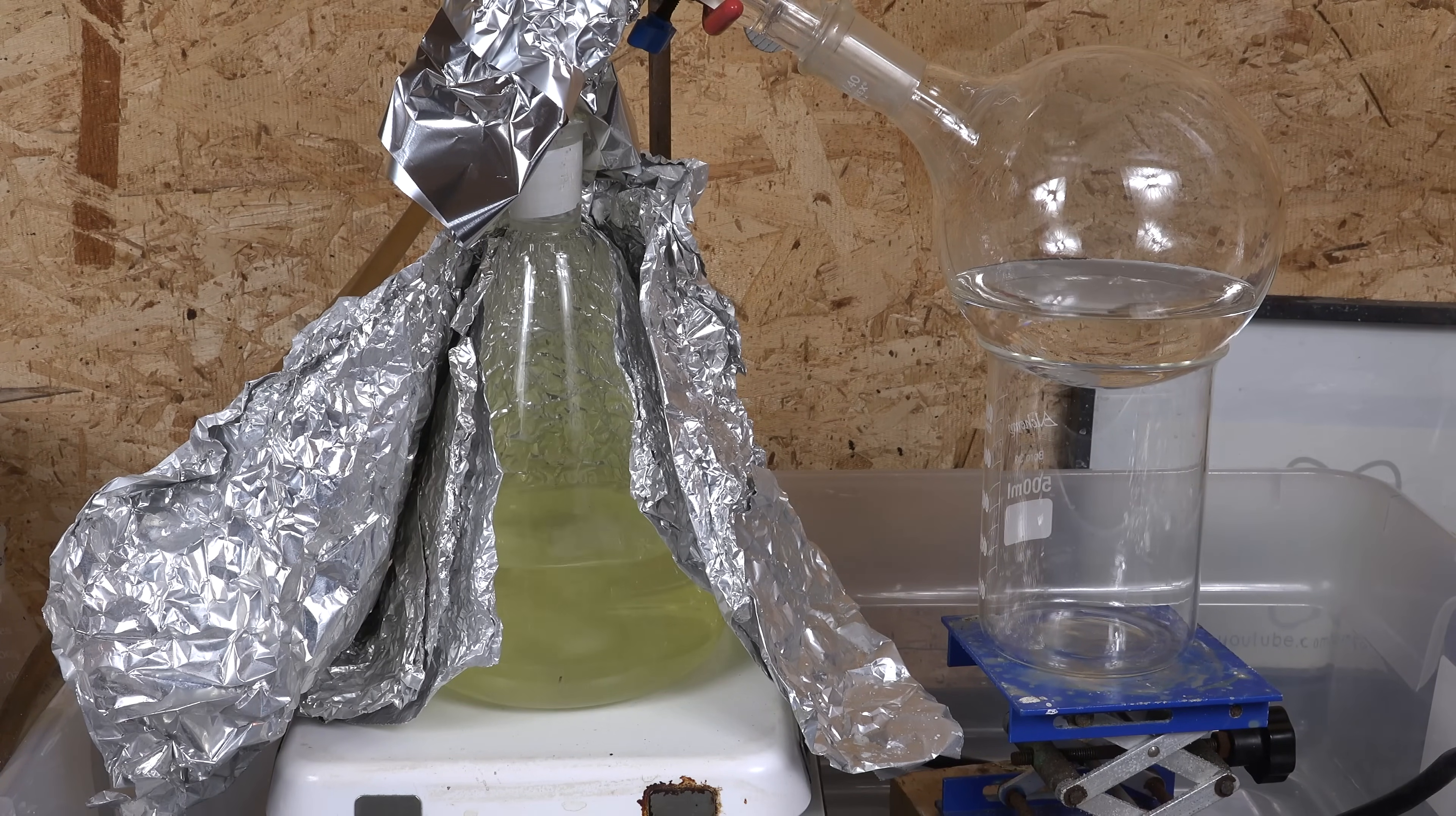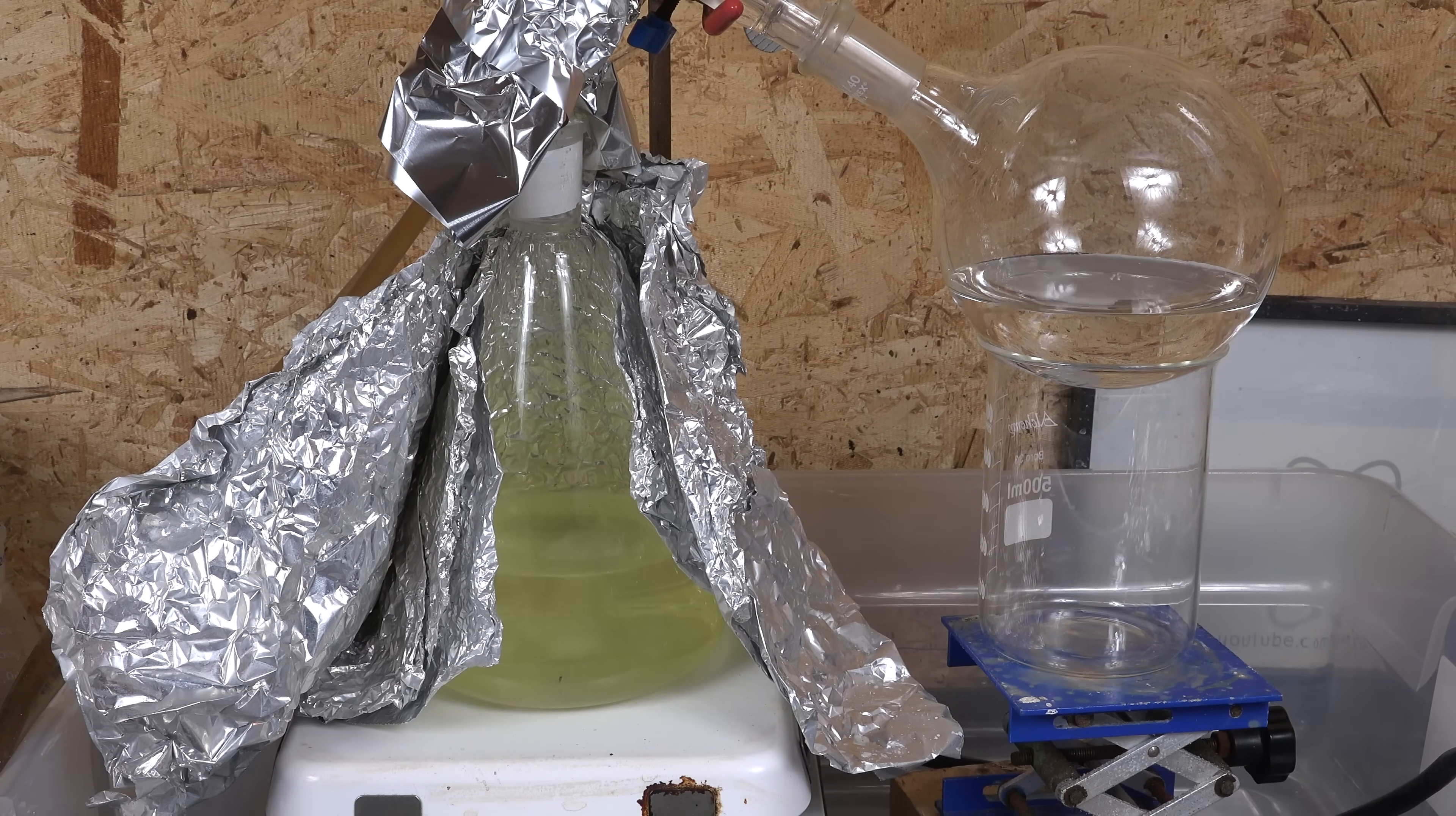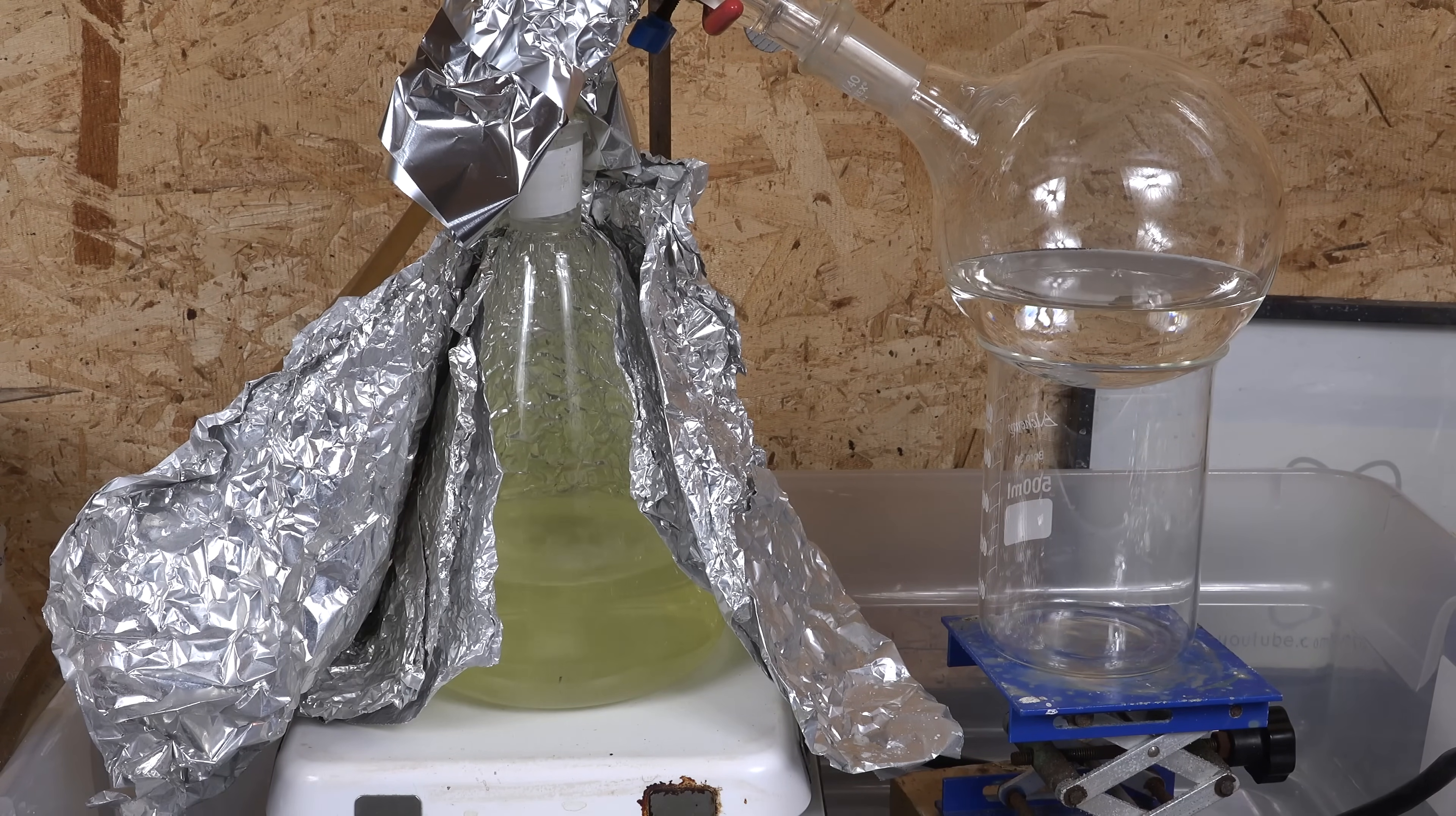In terms of safety gear, as usual you should have face shields and thick fire retardant lab coats. Nothing too special compared to other experiments. The idea is to have as much material between you and the acid so the acid eats that first before it eats you. There isn't much in the way of clothing that is immune to boiling sulfuric acid. So approach from the idea that you're sacrificing the clothing to it.